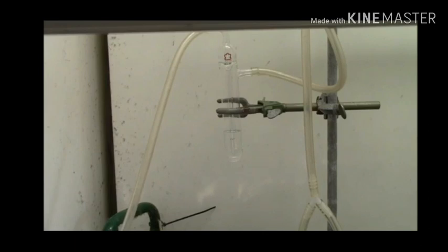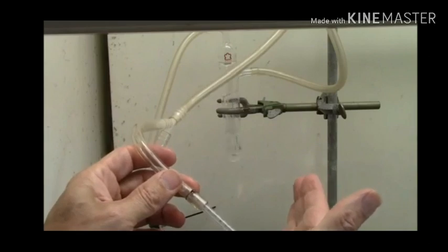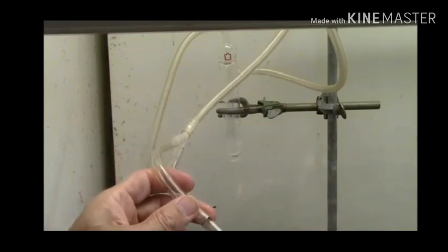Up here we have a bubbler tube that will enable you to see the rate at which the gas is flowing. That's a very slow rate. And that's clearly a much faster rate now. This rate is about right for evaporating dichloromethane. I can feel the gas on my hand, and it's a nice gentle wind.